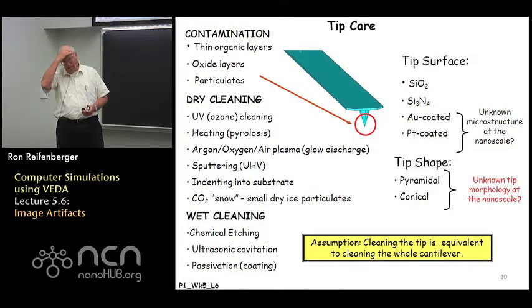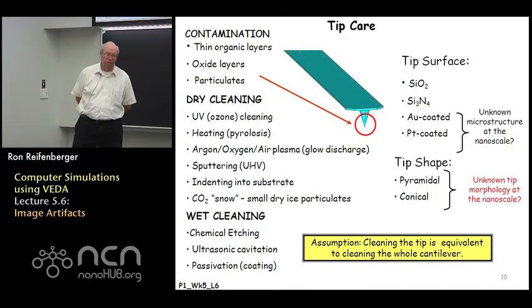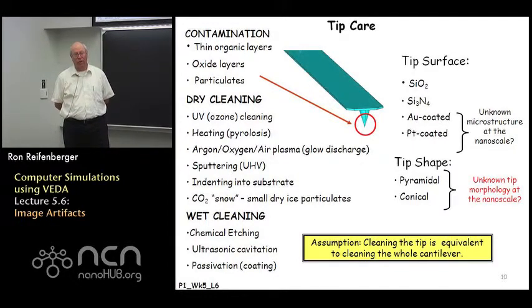I'm often asked about tip care, what a student can do to optimize the performance of an AFM by properly taking care of the tip. And I think it's more an issue about being aware of what can happen to the tip. A tip can certainly become contaminated, even though you try not to contaminate it. It'll pick up stuff from substrates, especially if your substrates are dirty. These tips are very good at picking up loose particulates and acquiring thin organic layers, which degrade the performance of the tip in a particular application.